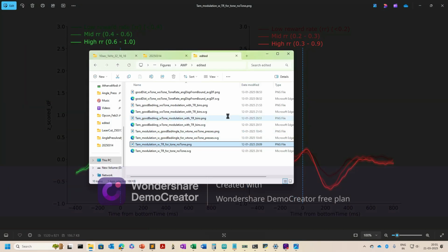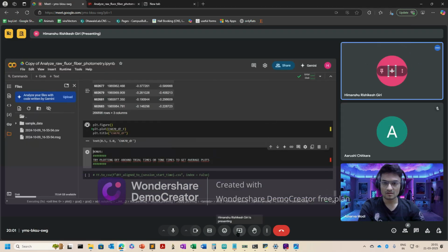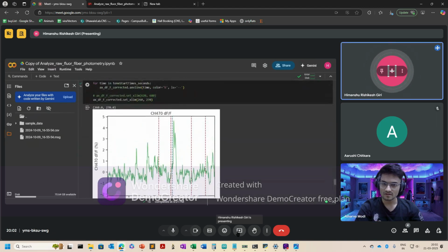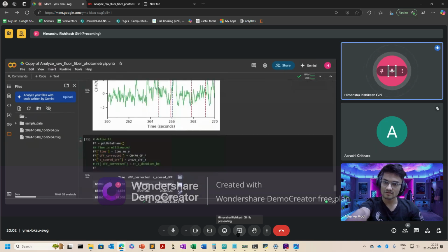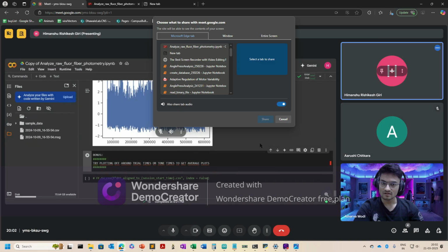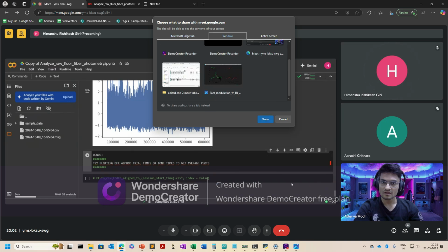Yeah, this one is just, this is DF, right? No, that one is DF, not DF over F. Yeah, I guess so. The DF over F we plotted already. No, this is DF. Oh, this is just DF. So you can generate many plots like this.